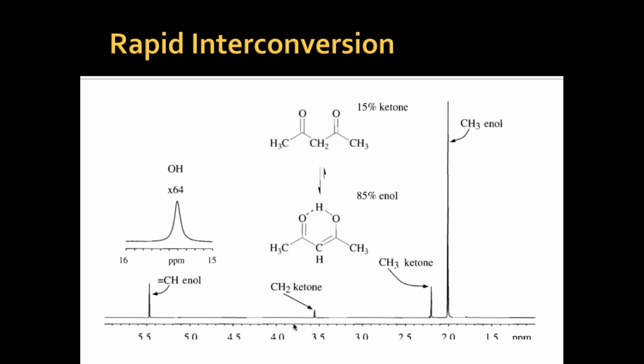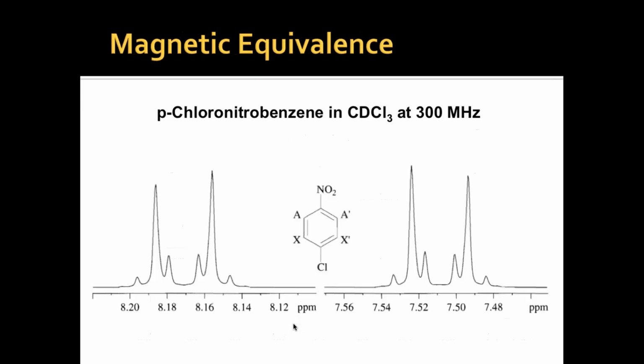All right. So the purpose of showing this here is that some molecules undergo rapid interconversion in solution, as you can see in this one. They undergo rapid interconversion from one form to another form, right? Between one isomer and another. So keto and enol, as is happening here in this molecule, can be shown in the NMR as well.